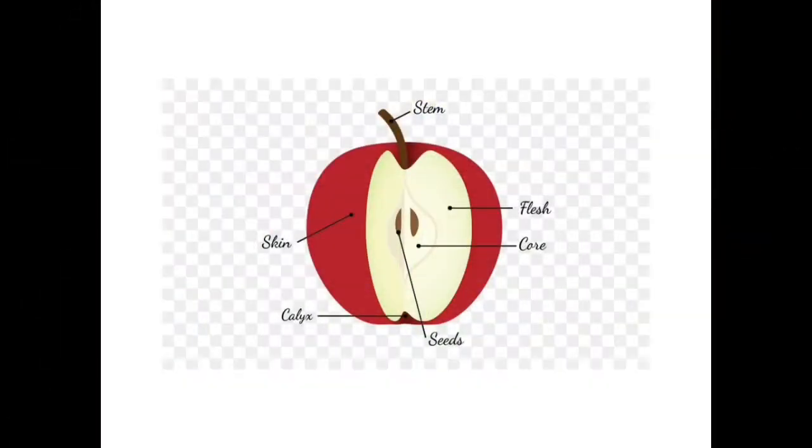Welcome all to the fruit dissection portion of this lab. So today we are going to dissect a few fruit, preferably something like an apple, but I'm leaving it up to your choice. Okay, so we're going to talk about the basic structures of a fruit.